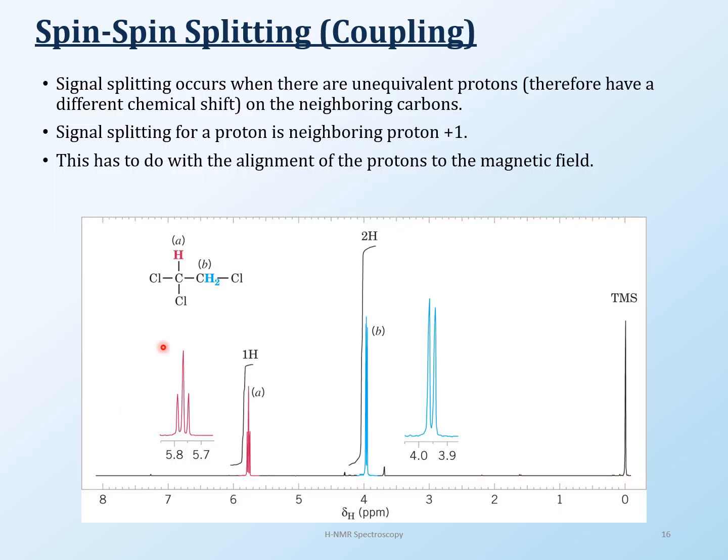Now for spin-spin splitting, coupling. This is the most interesting part, because if this wasn't there, NMR would be made up of just single peaks everywhere. For this one, I should say, whatever you're doing, just focus on listening to me. I know this presentation is very long, but for this part you have to listen carefully to understand how coupling works, because coupling can be a little confusing, and if you miss one little thing, it can be confusing. So just focus a little bit here.